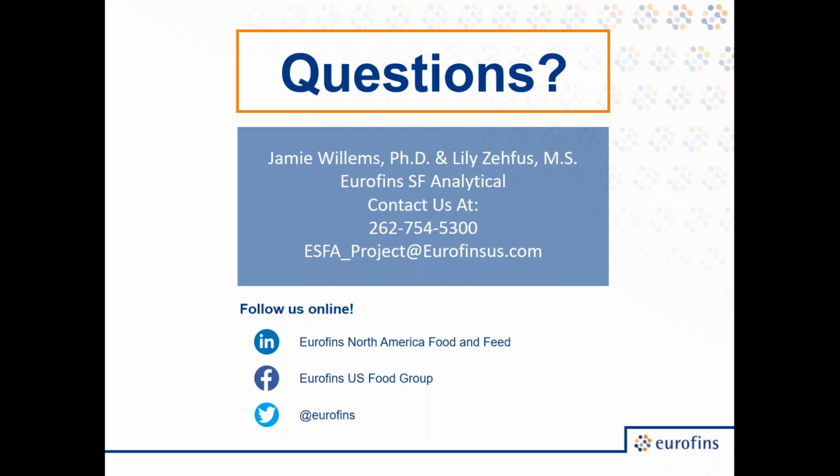Thank you both. Our next question here is, what kind of compounds can be detected in pet foods? I can take that one too. So, really our techniques aren't limited to the types of compounds we can detect. When I think of a pet food in particular, I would be looking for rancid compounds, potentially volatile aldehydes, or really it would depend on the description of the off flavor or off odor. But we're not limited. Anything that's volatile can be detected.